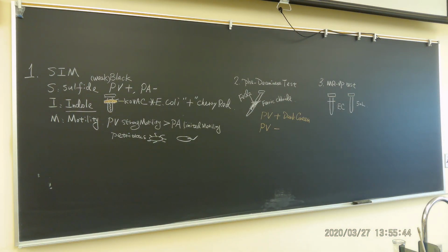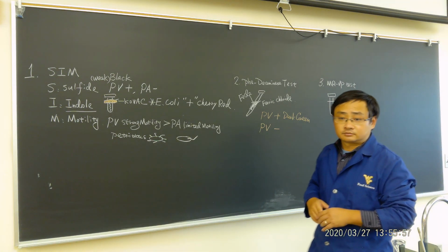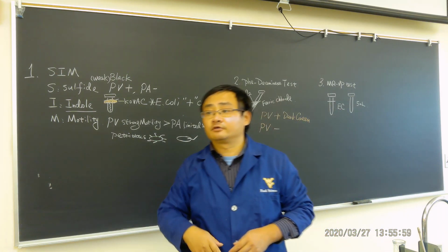You don't have a solution. Give each of them an empty tube. That's a 15 ml tube. Sorry, I forgot to give you one.